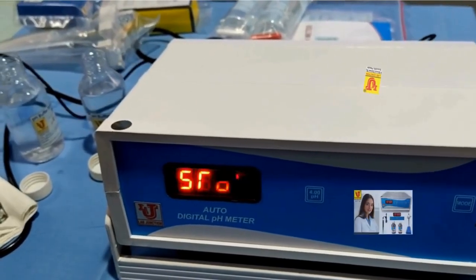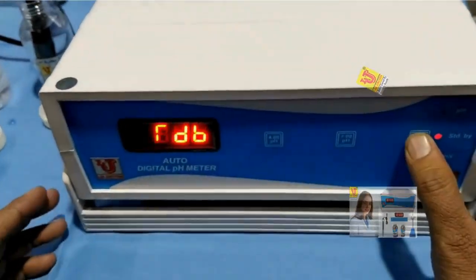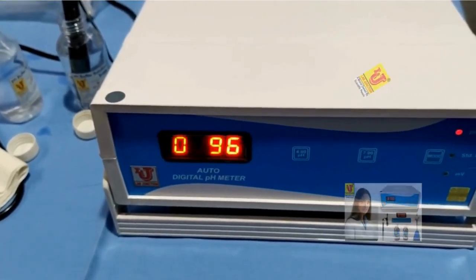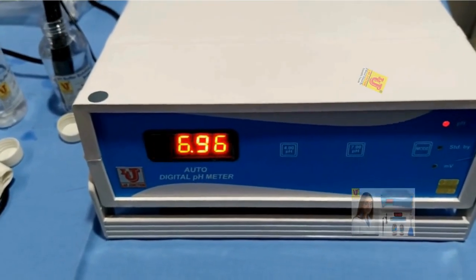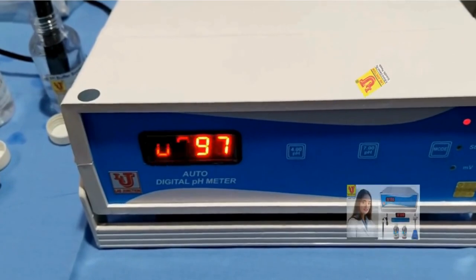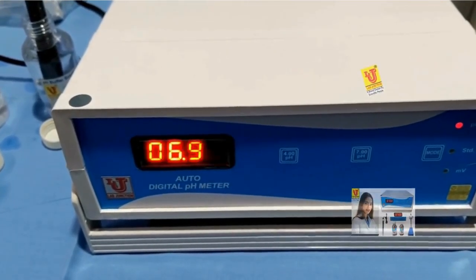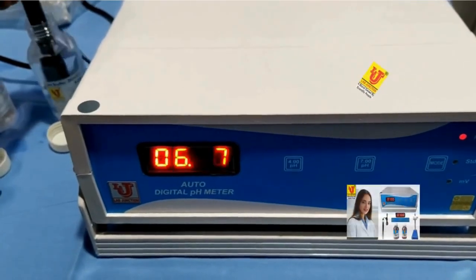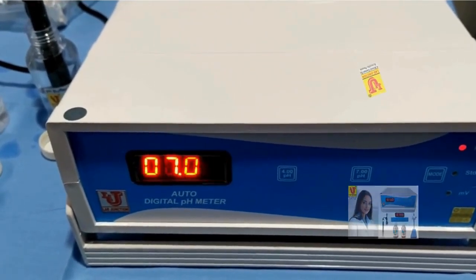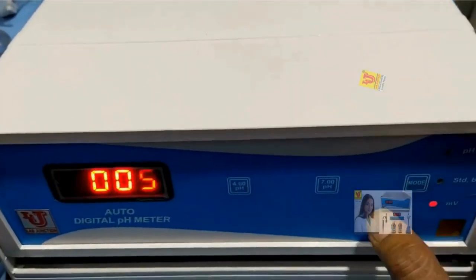Suppose my sample is the pH 7 buffer. Go to pH mode — it directly shows the result of your sample. Now I am going to standby.